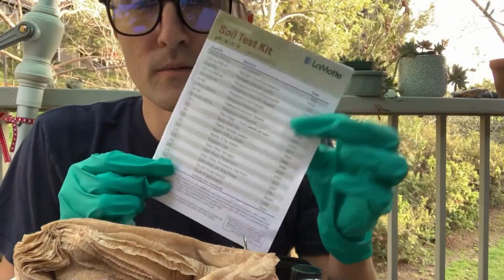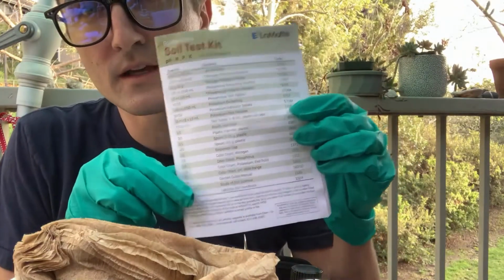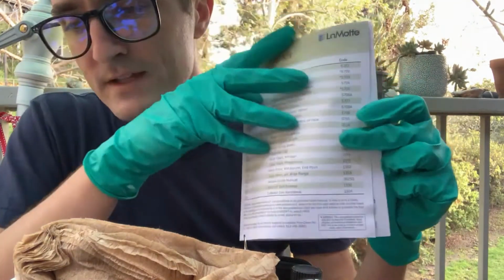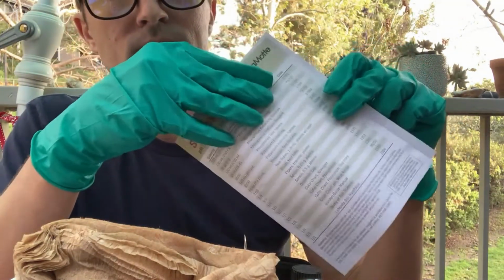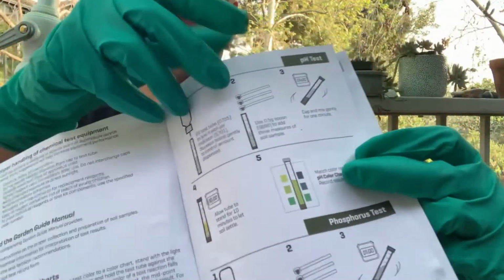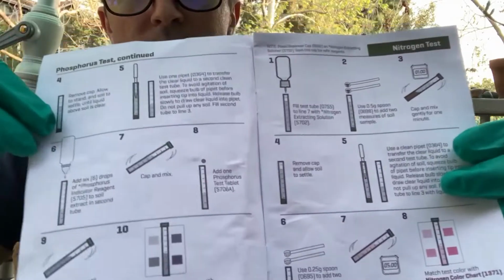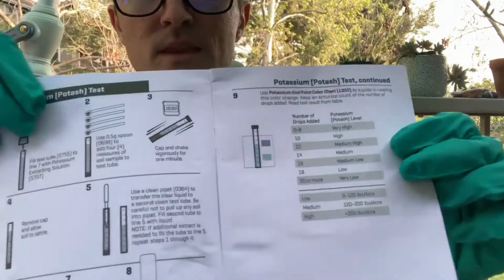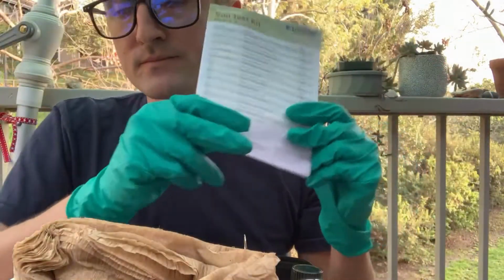This little page here is the instructions for doing the tests. So make sure you have this out and handy so that as we go through, you can follow along with the different tests. Now today we're doing nitrogen, phosphorus, and potassium.